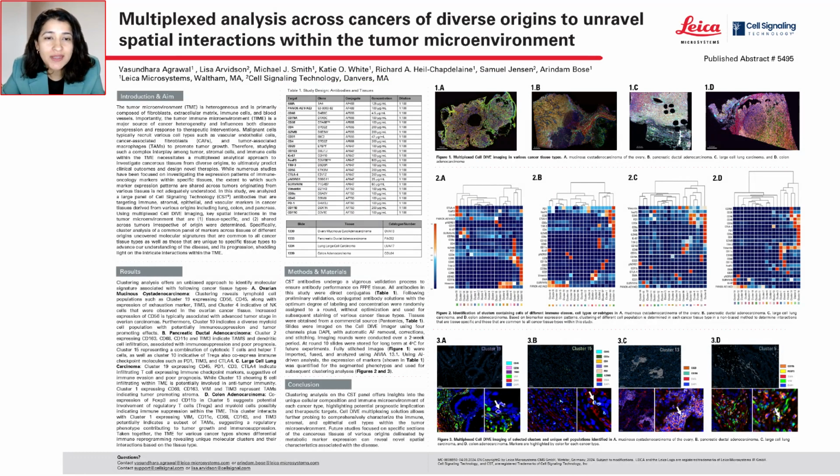Slides were imaged on the Cell DIVE imager using 4 channels plus DAPI with automatic autofluorescence removal, corrections, and stitching. Fully stitched images were then analyzed using Aivia 13.1.